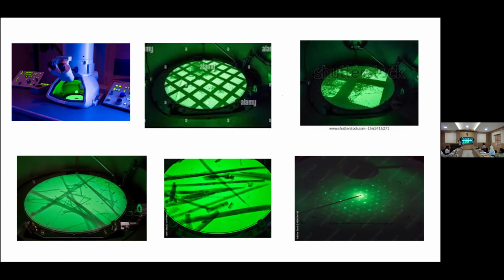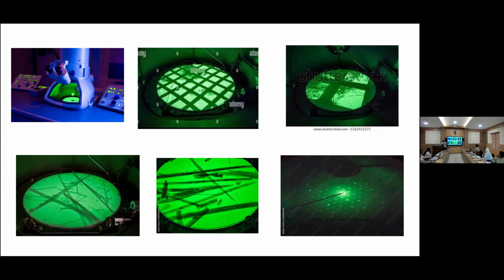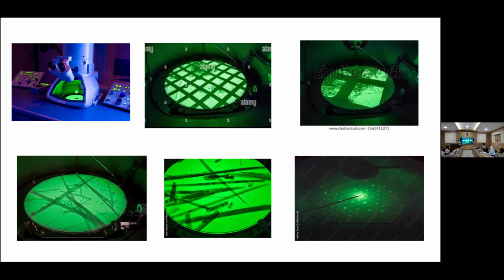Okay. With the 200 mesh. That is the commonly used grid in our lab. Say 3 mm 200 mesh copper grid with a carbon coating to support the samples. So here we choose this region, and there then we go for mag mode, because in that section I told you we are using different mag modes. In low mag we will see like this. In mag mode we will see like this, and this is the diffraction pattern you see in this screen.